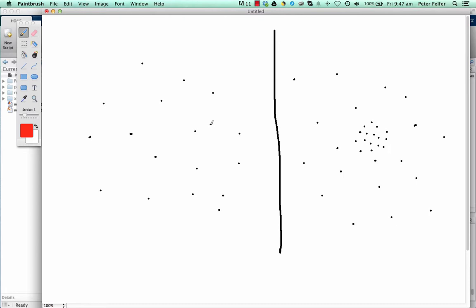All the parameters that you get should be related to some physical properties of the system. As a demonstration of what the principle behind it is, I've just drawn here a couple of points where this is what I produce as sort of perceived as random. And this is something where you can see that there's a little cluster in there.